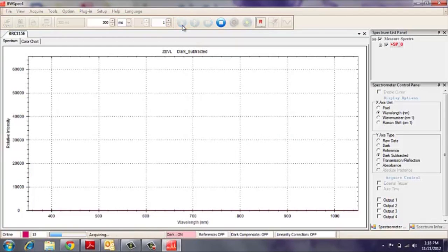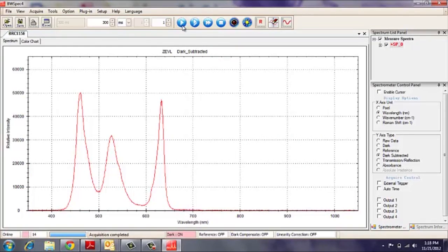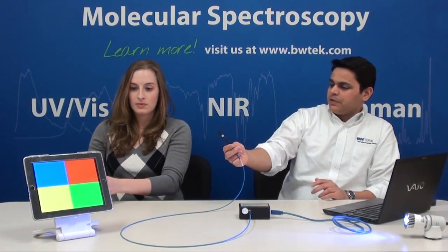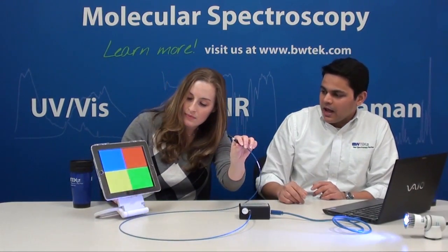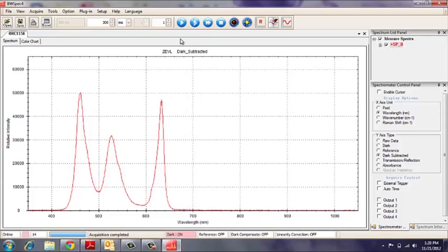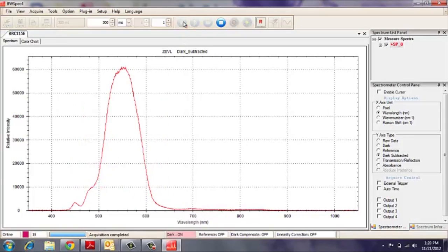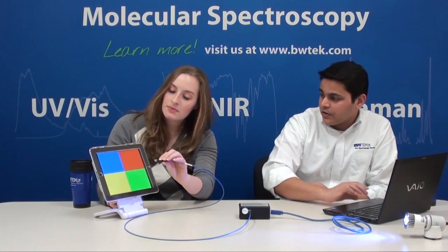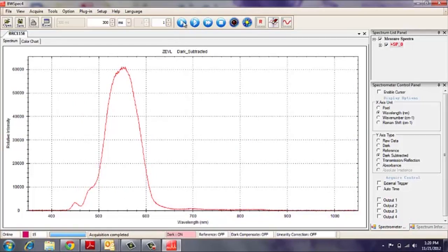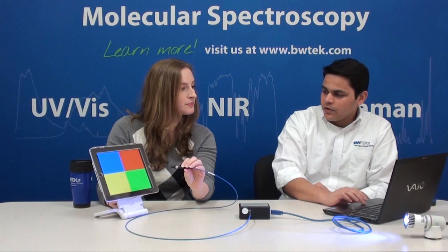Now that I've collected the dark spectrum, if I take a single acquisition of this LED light source, we can see the different characteristic wavelengths of that light source. Putting this up against the different colors on the iPad, we can see the different characteristic wavelengths of the green. Red would be another cool one to see — and you can see the red there, just taking a single acquisition.